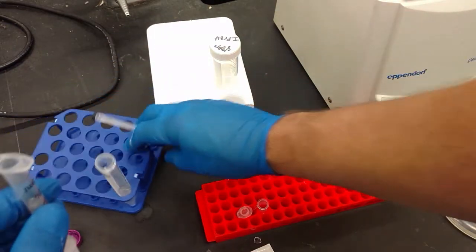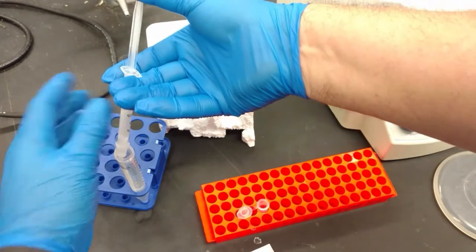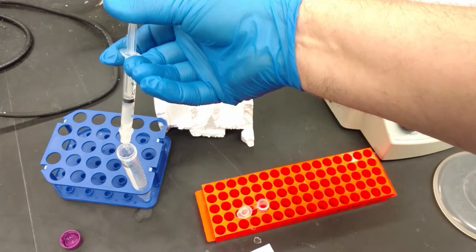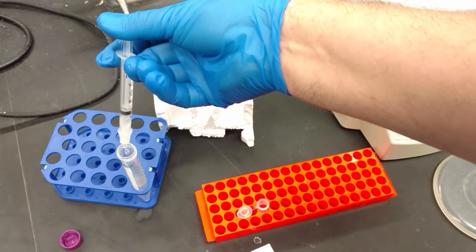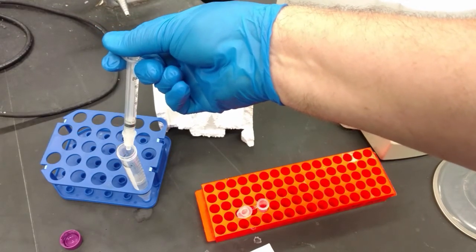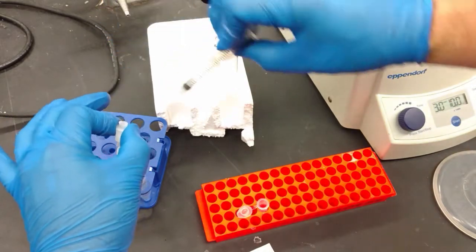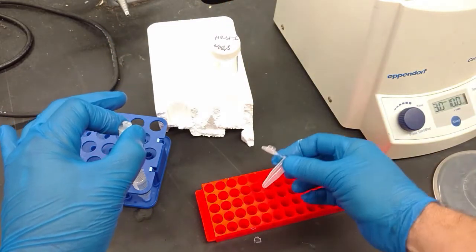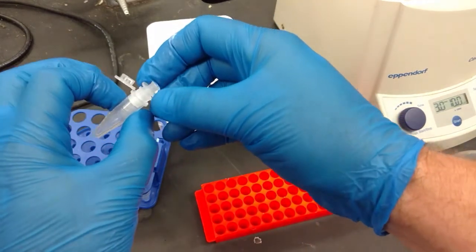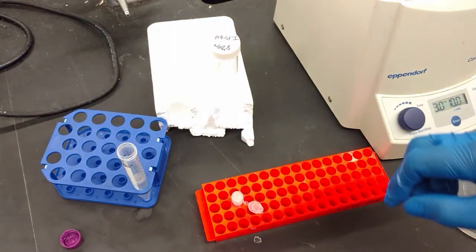And we can use that 15 mil tube for waste. And you just push it through. Just like with the filters, never pull back on the plunger, always disassemble it. And so now we have our column, and it's got your DNA on it. And so what we have to do now is dry it.